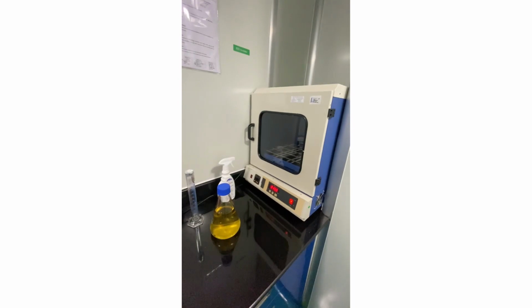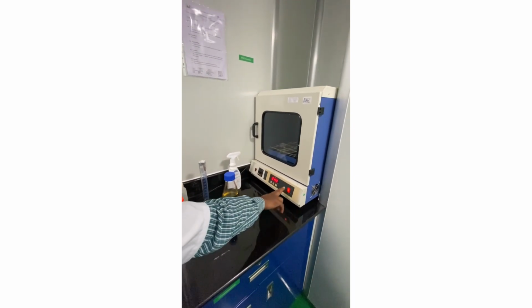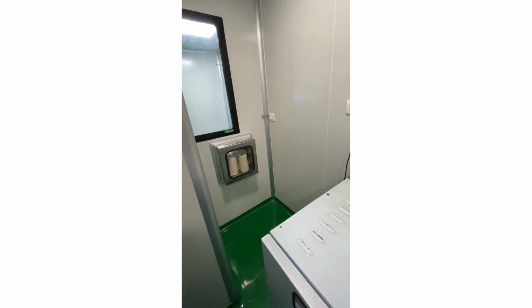Like that, we are mixing properly. After that mixing and preparation, we are taking those samples through the pass box to that room.